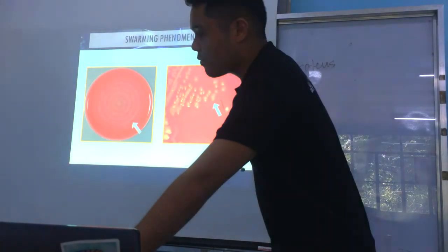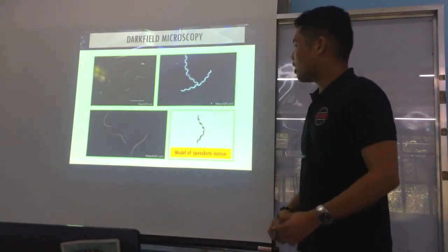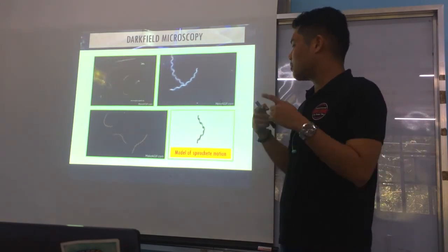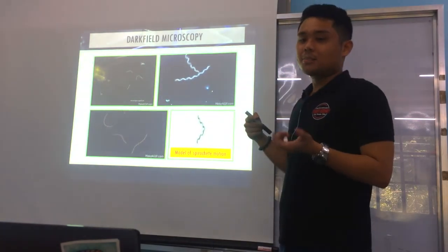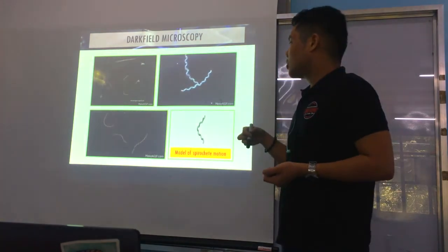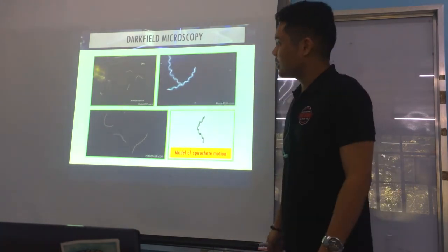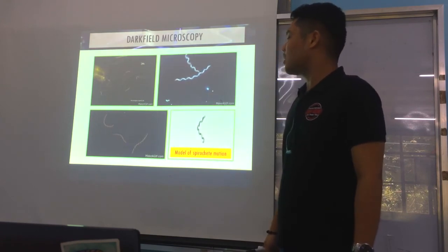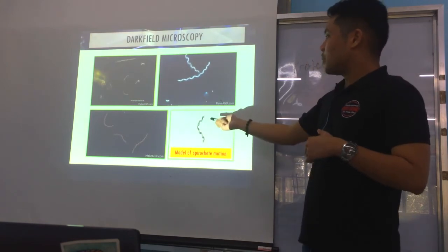Alright. And of course, you have your dark field microscopy. Ayan, diba? Dark field microscopy, that's for your spirochetes. As you can see, diba? As I mentioned, sa characteristic motility sa inyong spirochetes, diba? It's spiral in motion, diba? Alright, so dark field. So as you can see, against the dark, makita mo ang mga spirochetes, diba? It's so amazing. So spiral organism.